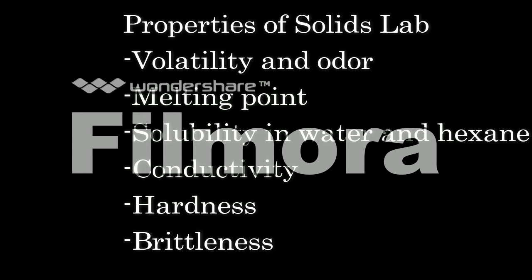Properties of solids lab. Basically in this lab we will be testing different physical properties of solids in order to help us determine what type of bonding the solids have. So we will be looking at the volatility and odor. Basically we'll be looking at how the substances evaporate and if they have an odor or not, the melting point, so the temperature at which a solid turns into a liquid, solubility in hexane and water, the conductivity, so the ability to conduct electricity, the hardness of the solid, and the brittleness of the solid as well.